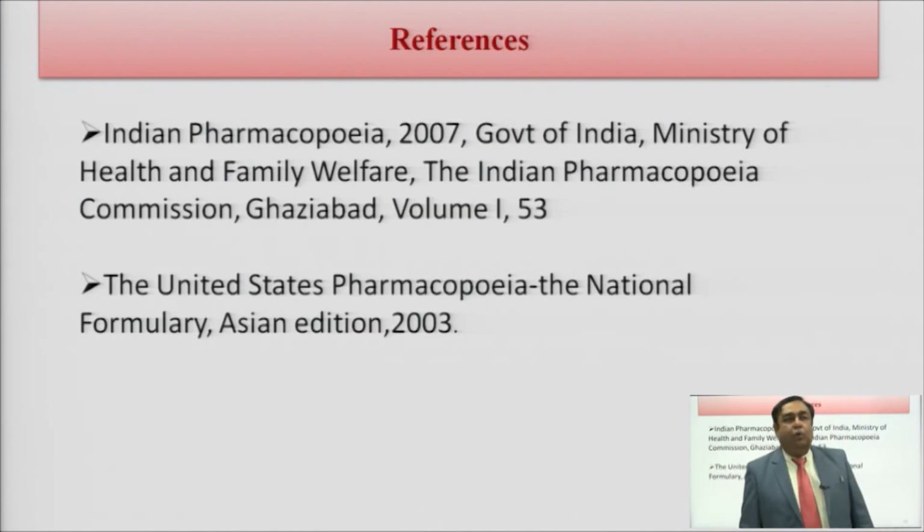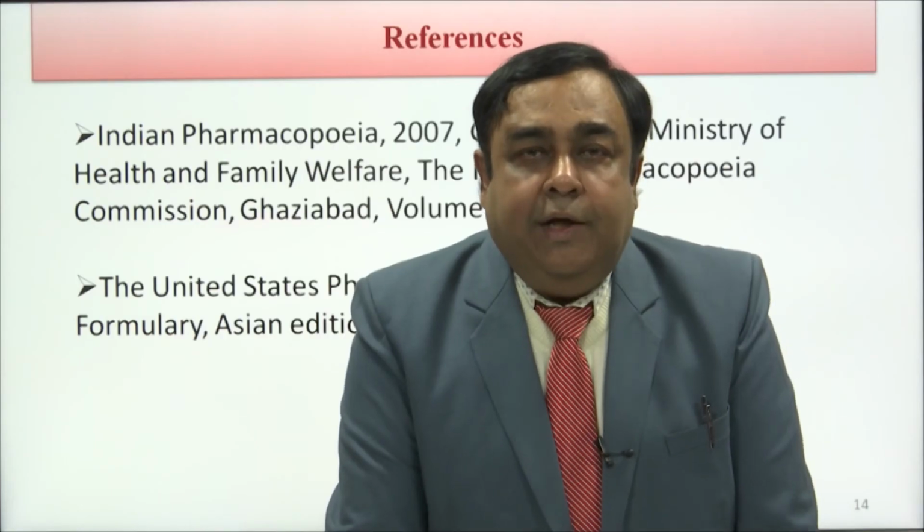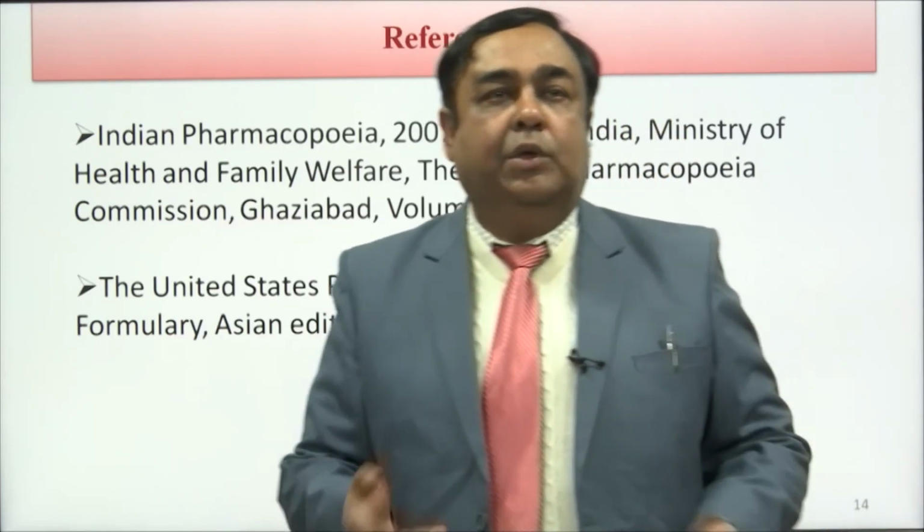You need to refer to the Indian Pharmacopoeia and United States Pharmacopoeia for this particular topic. Now, I will be showing you two videos which will give you an idea about how it happens in an actual industry.